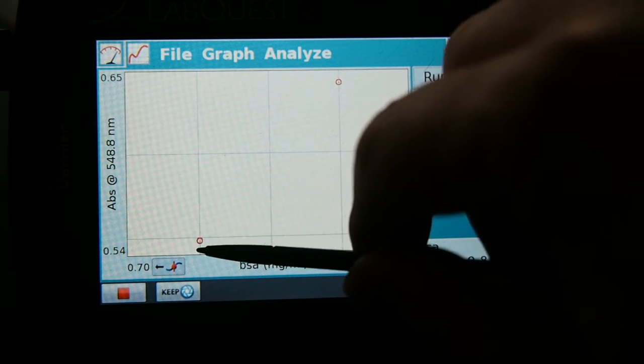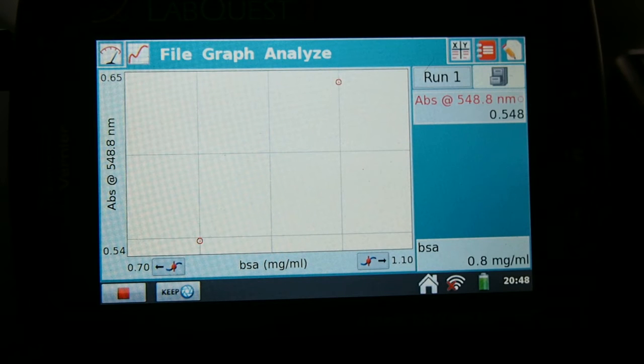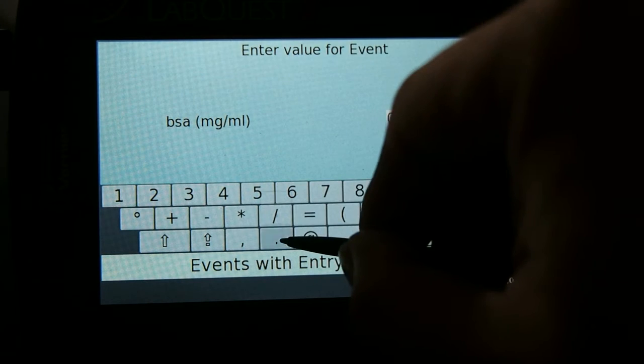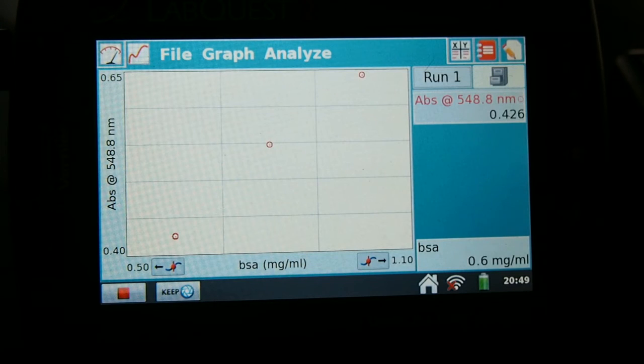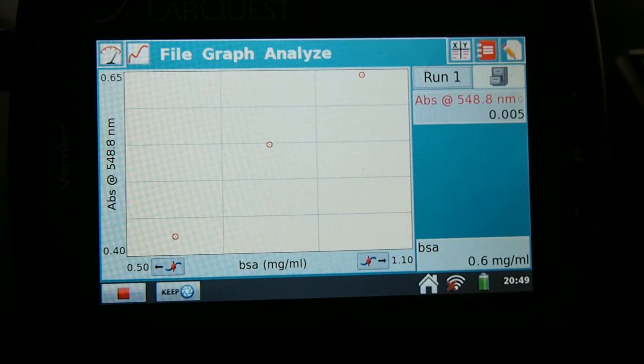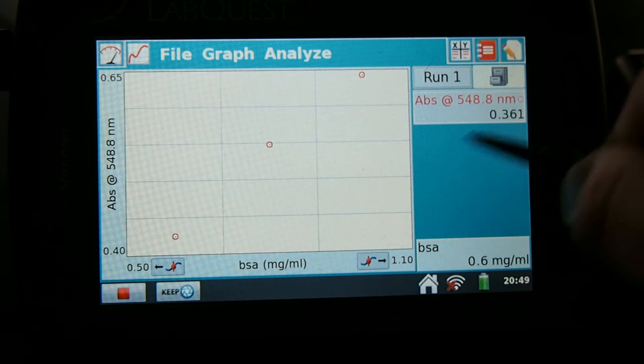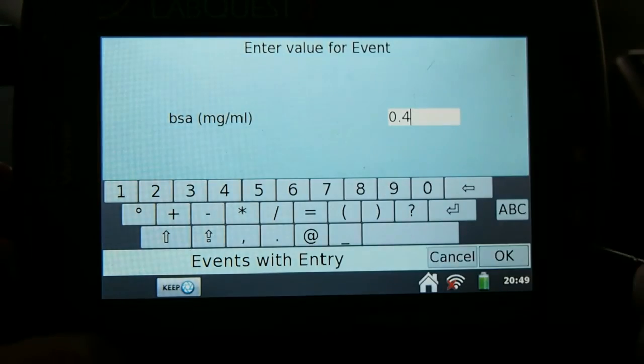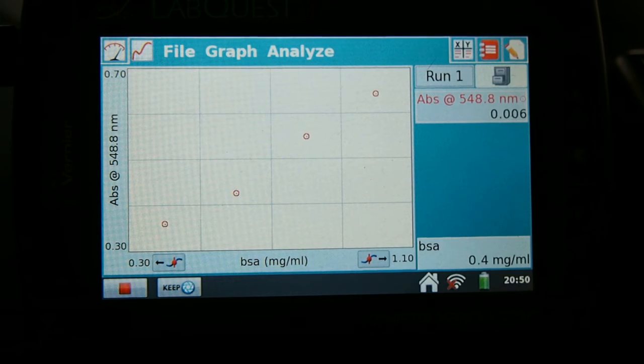We can continue to do this with each successive sample, and you can see that there are two spots on this graph now. Continue working through each sample or standard until all of the curve points are represented. We can put in lower and lower concentrations and get lower and lower response or absorbance on this scale.